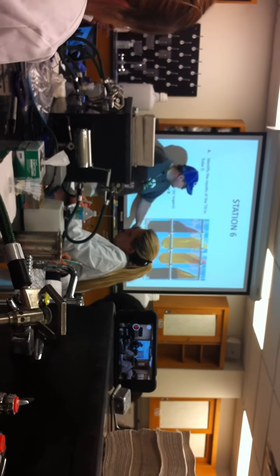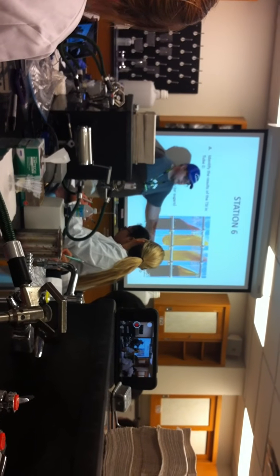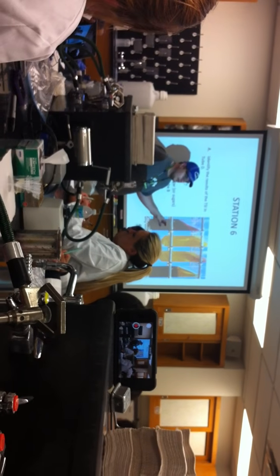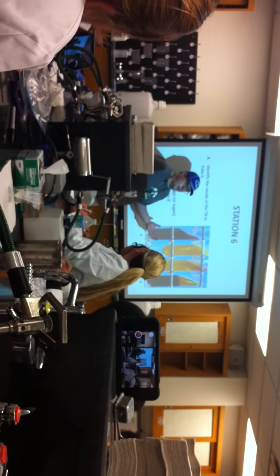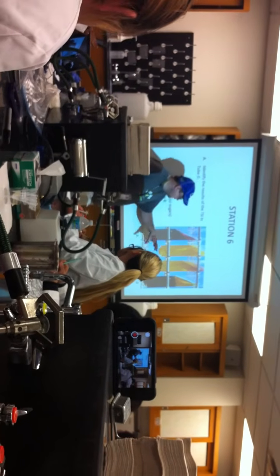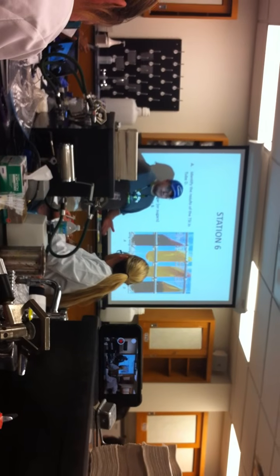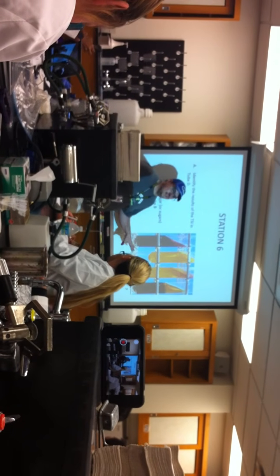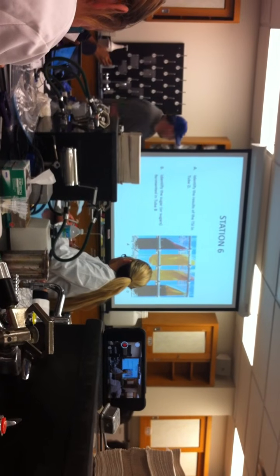You just need to tell me slant over butt, fermentation over fermentation, and what's produced. And if it's sulfur reduction, tell me sulfur reduction. I'll take black precipitate. Gas is produced. Tell me gas is produced. Okay? Any questions about that? Just tell me what you see, and that's a viable answer. Okay, but you do need to be able to see them.